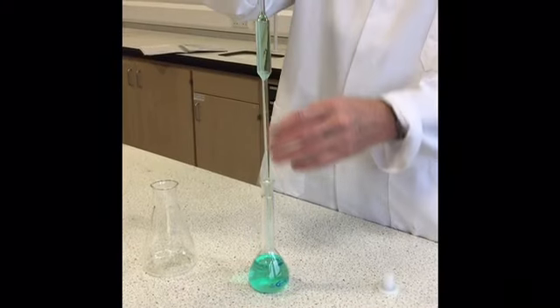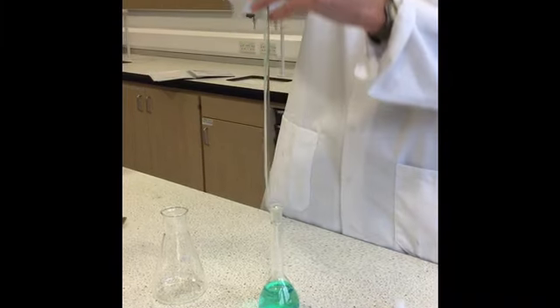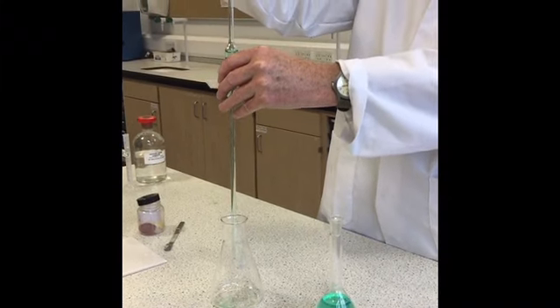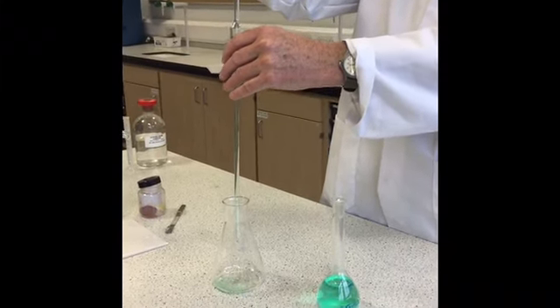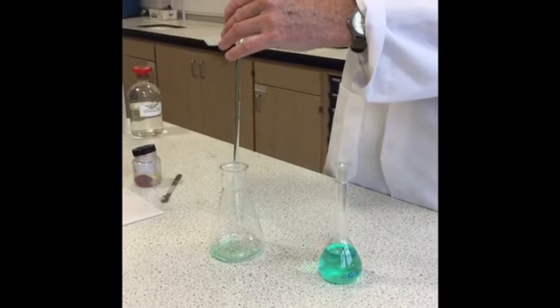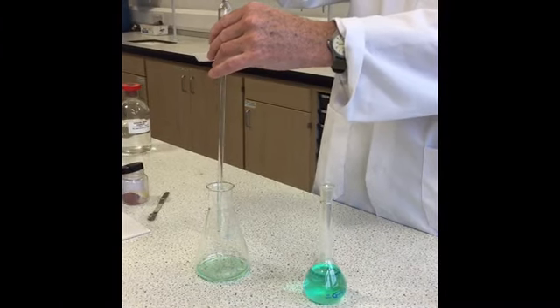Okay we now transfer 20 mils of the nickel salt into the conical flask. We have of course already washed our pipette with a few mils of our nickel solution prior to getting the 20 mils for transferring.